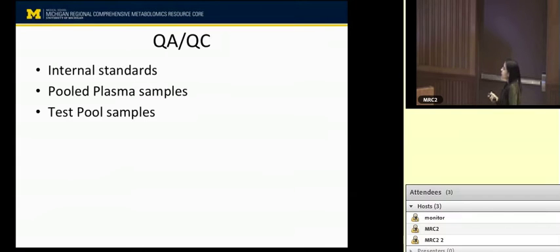So for the data analysis workflow, we start with the raw data peaks that we get, the peak areas. This is our raw data. And then we do the QC analysis. And then we go for normalization. And if any pre-treatment is required, we do data pre-treatment. And from then we go for univariate and multivariate analysis.